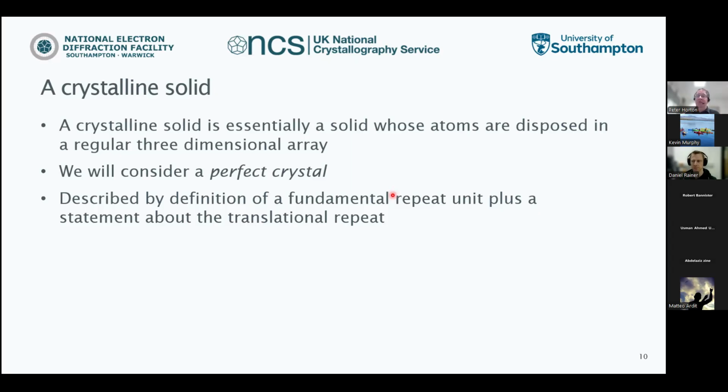The atoms inside the crystal vibrate. We see them at room temperature, possibly at low temperature. We never see them at absolute zero. So all the atoms are vibrating. A perfect crystal we use for the maths and everything else, but they do not exist. But actually, it helps a little in seeing what's going on.